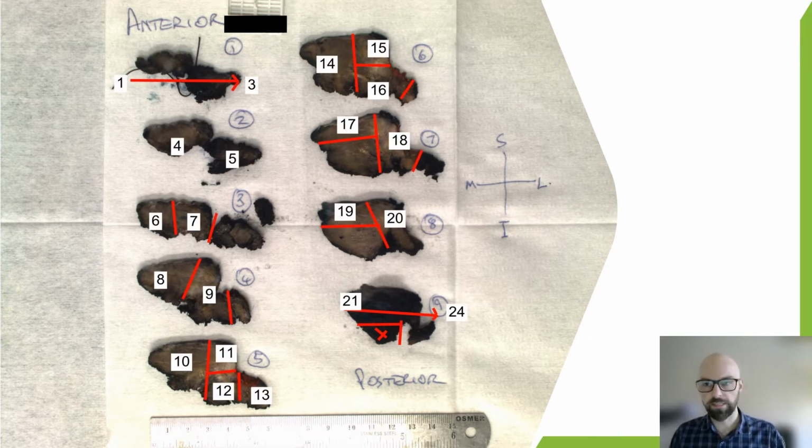And then those slices are cut up into smaller pieces, which are then processed into slides, noting the different slide numbers, which really helps with reconstructing the tumour under the microscope. And it also helps if there is, say, a close margin. We can go back and look at the exact slide and tell on the specimen exactly where that close margin is. And so then we can go back to the surgeons and say where that is.